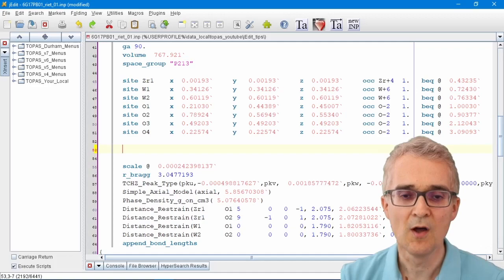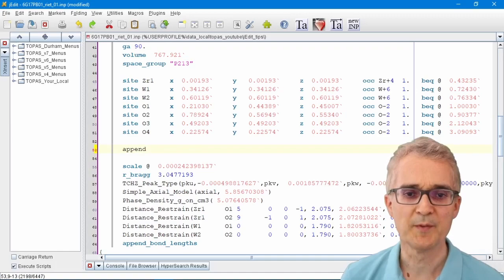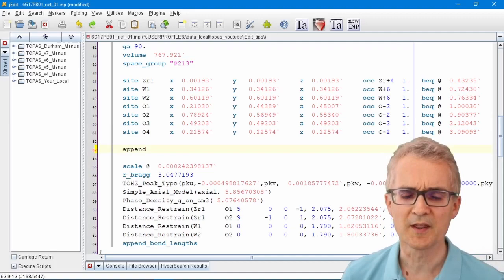Often when I'm working with Topaz I can remember the basics of a command but I can't remember the exact syntax. For example, if I want to calculate bond distances and angles, I'll remember that the command is something like append bond lengths or append bond distances.